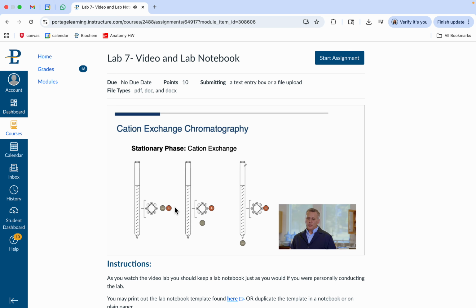We saw previously column chromatography, and we talked about DE, AE, and CM. Just to remind us, today we're going to use a CM column, and this one is ultimately going to be cation exchange. Here we see that we actually have a positive charge, and it's binding to a negative. But ultimately, with a cation exchange, we would have a bead that has some negative charges on it, and then we would have a positively charged protein, which is what happens in CM. All right, so this is a general scheme for our DEAE, but we can apply it directly to CM.